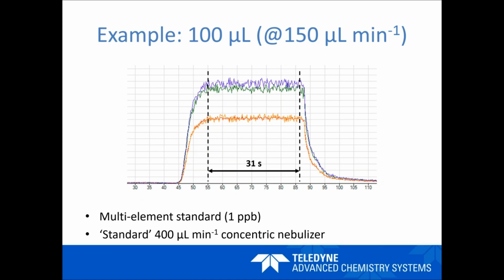And with every new generation, the sensitivity has been getting better and better. So to go down in terms of flow rate, you sacrifice a bit of sensitivity, but with modern ICP-MS, that matters less. So at lower flow rates, you can stretch out your sample. You can make the most of it. You can get more from it, more data, more replicates.